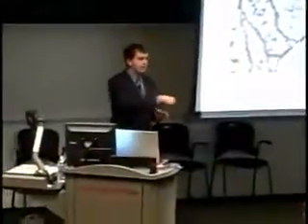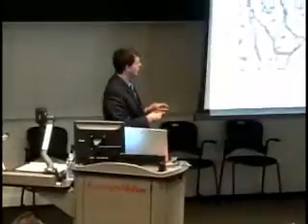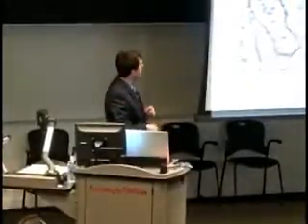Here you can see how the user can just specify roughly where the cellular boundaries are, and the computer can find them automatically. The way this works is basically using dynamic force fields that push each side of the ribbon towards each other and towards the cellular boundaries.